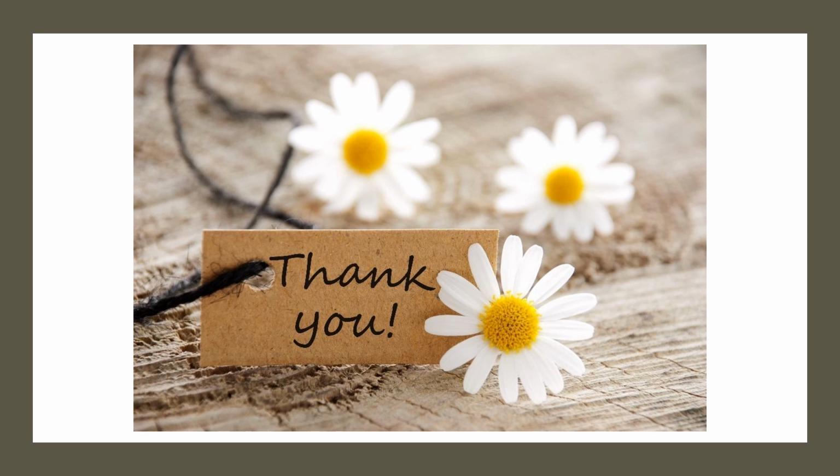So friends, this is all about out of specification. In this video I have explained the concept for training purposes, right? Basically, OOS investigation shall be carried out based on what kind of OOS is observed, that is, for which test and by what type of instrument used for the testing. I hope you can understand the concept of OOS handling.